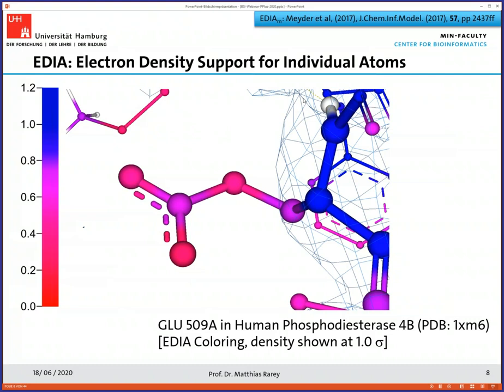Here you basically see electron density at the one-sigma level — information many modelers usually don't look at, but really should. It's always hard to get this information and look at it at the same time as the structure. So here's a way to get a color code which shows you which atoms are not well resolved in the crystallographic structure. There might be very good reasons for this — typically you might have some flexibility in that region. From the modeling perspective, this is extremely important information: which parts have high rigidity and are well resolved, and which are not.